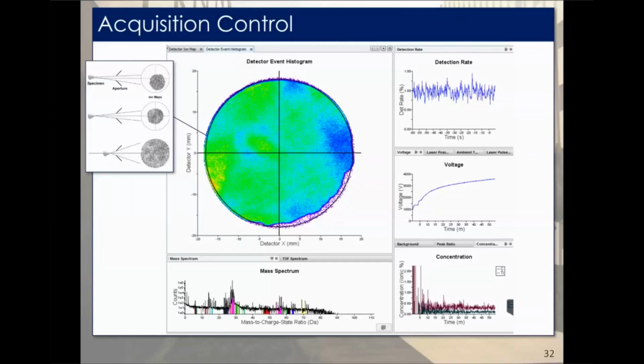So hopefully at this point, we are setting up our atom probe experiment. It's running well. We're generating the data well, and all the metrics look good. We're happy with it. And once this is set up, most of the time, we can then leave the atom probe to run automated. It'll run both by increasing the DC voltage or changing it as necessary to hit that detection rate. Then it'll also be scanning and focusing the laser automatically if you're running in laser mode. And then it'll be able to take its time to acquire all the data that you need.